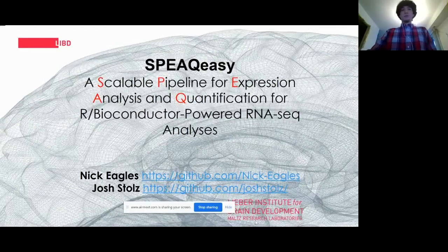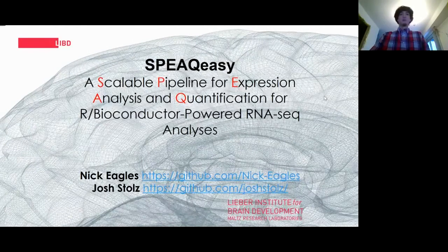As Leo mentioned, I'll be presenting along with Leo a pipeline called SPEAQeasy, which stands for a Scalable Pipeline for Expression Analysis and Quantification for R and Bioconductor-powered RNA-seq analyses. Originally, it would be me and Josh presenting. We have the GitHub links.